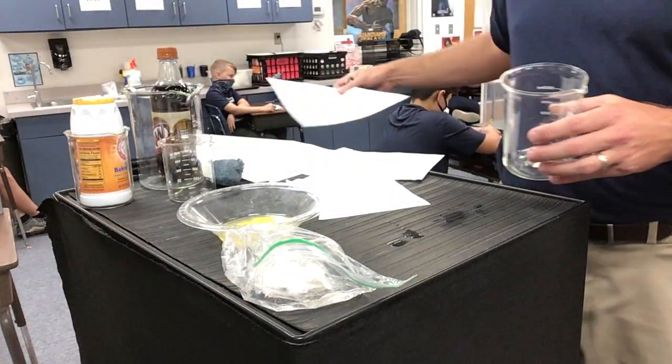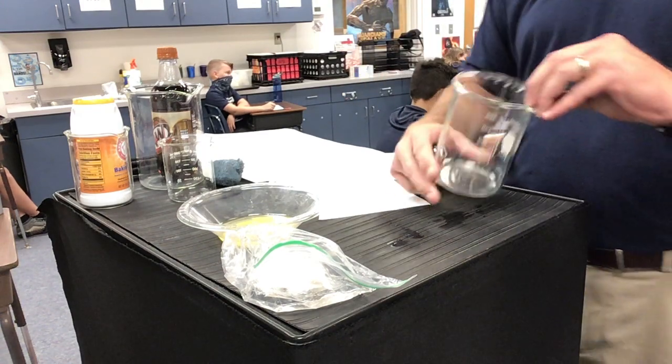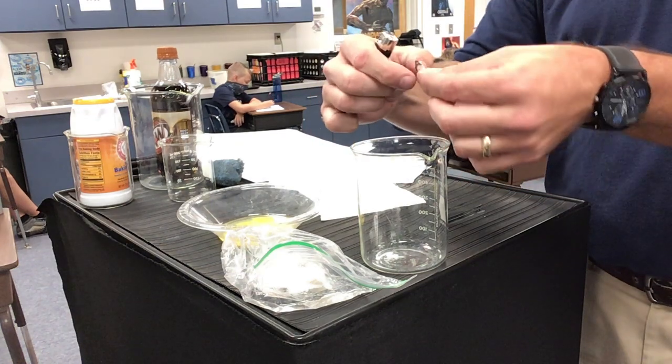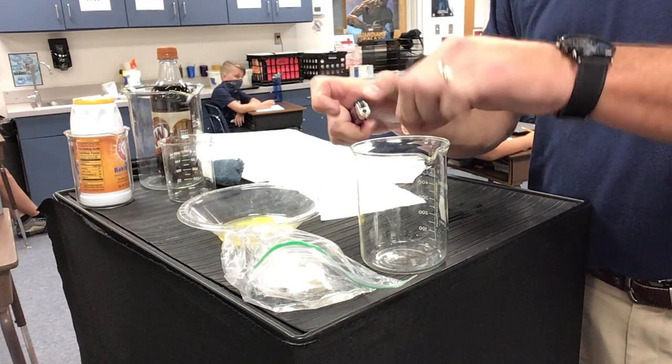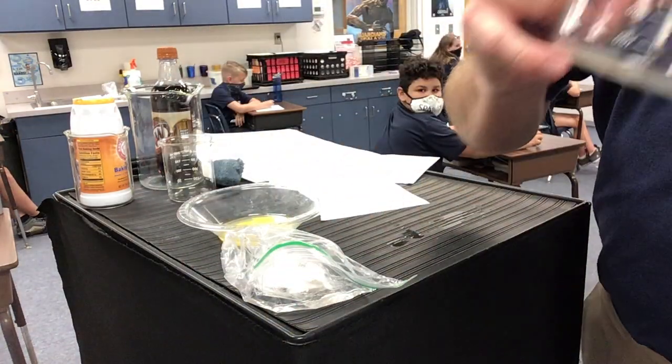Did it produce a gas or bubbles? Did it change color? Again, for those online, I'll let you see it again. Is there any kind of a gas? Is it changing color?